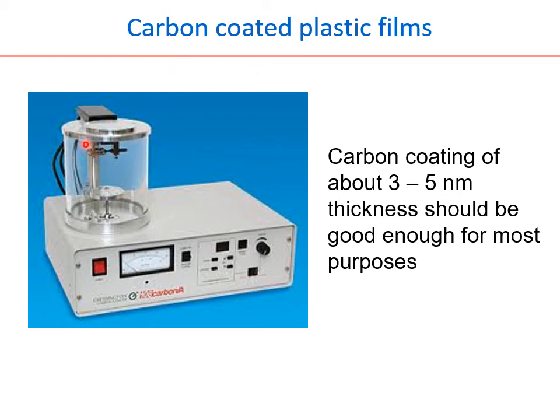This electrode setup that you are seeing will be replaced with a coil of metal, so that in an optimal vacuum condition with a slight leakage of air, there will be electrons flowing from here. The electrons that flow from here to here will bombard the carbon surface, thereby creating charge centers on the carbon. The presence of these charge centers on the carbon film will temporarily suspend or nullify the hydrophobic effect. So these charge centers will allow the water to deposit on it, and that will be helpful for us to take the experiment forward.